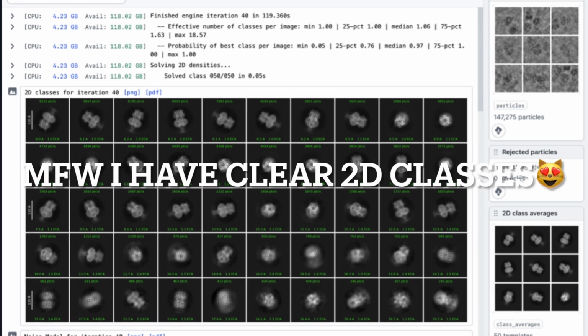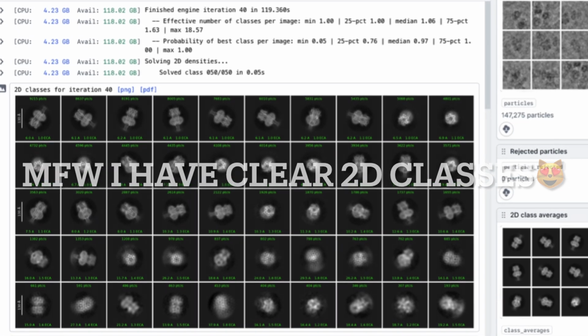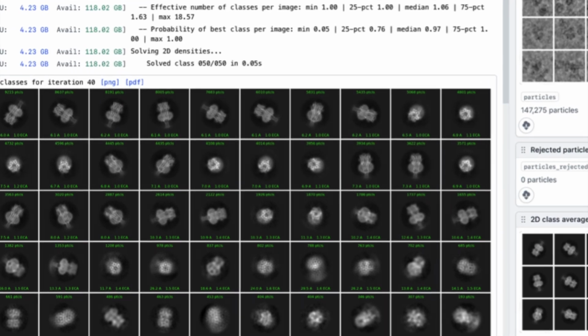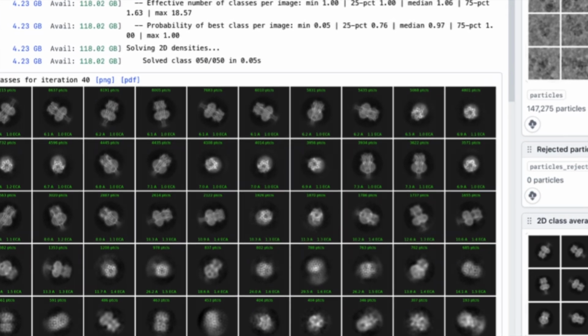So then when it goes back into the actual reconstruction, it'll get confused and you won't actually get what's happening in reality. So you're trying to toss out all these junk images that have nothing in them, and you only want these 2D images that show a very clear receptor binding to some toxin. And that leaves us with, once you go through that whole process of tossing out all these junk particles, roughly 100,000 particles to work with.